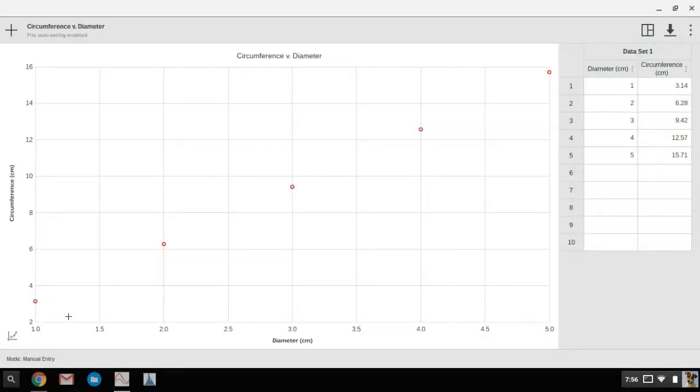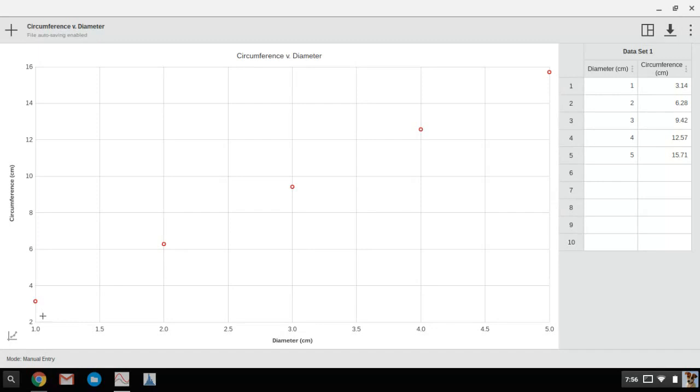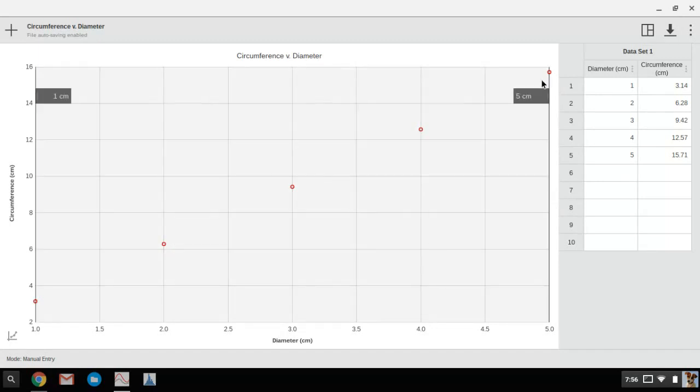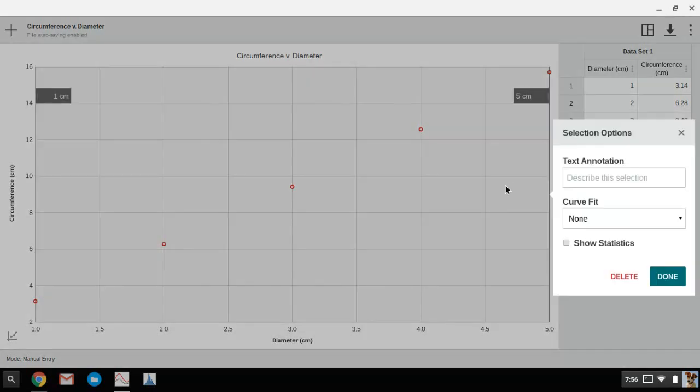Now that's just the completed graph, but if I want to add a line of best fit and get slope and y-intercept, it's also pretty quick and easy. I just left click and drag across the screen.